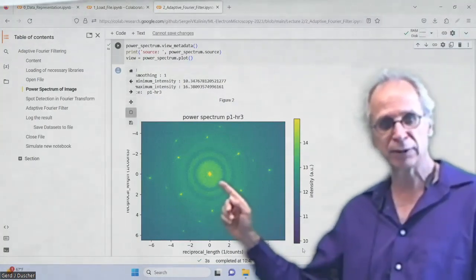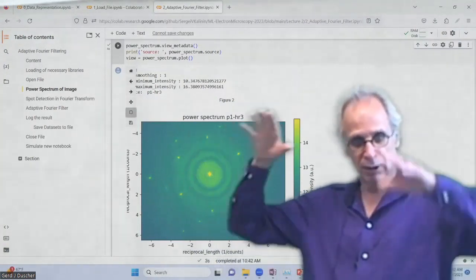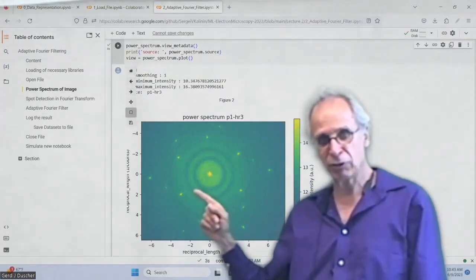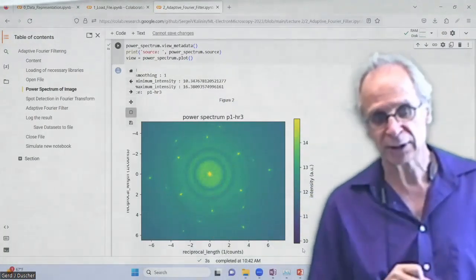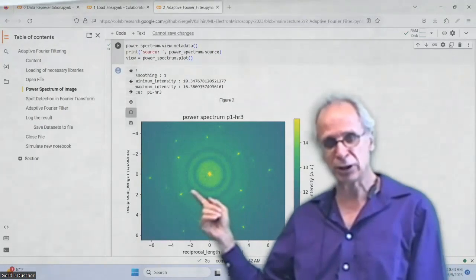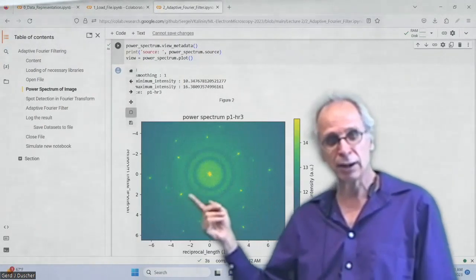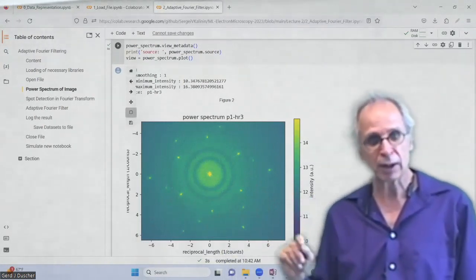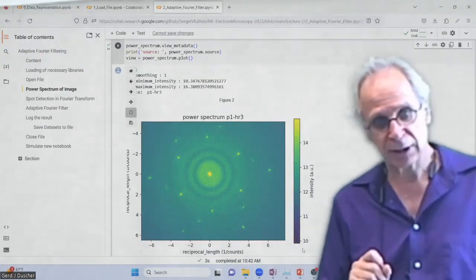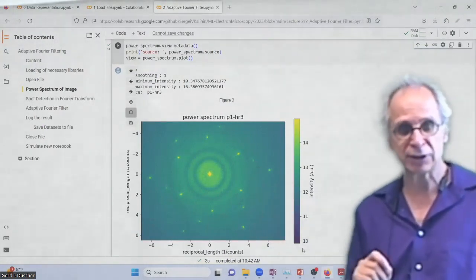And it's bright. So what do we have here from the amorphous material? We have this background with some information missing, that are the so-called Thon rings. We're gonna look into that and we'll see that I went actually to an underfocus, a term we learned, right? A bit more than usual. And these are related to the Bloch waves. So it's not really Bragg peaks, but the angles are the same, right?